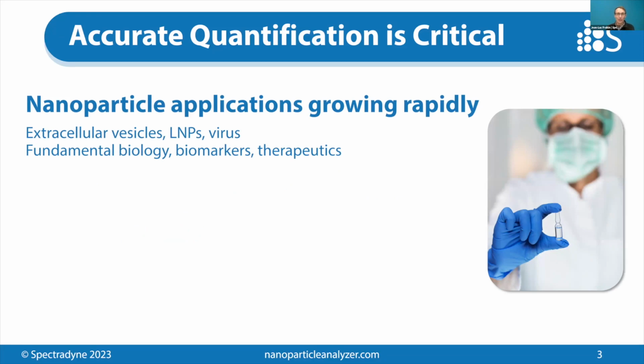The reason that's important is because nanoparticle applications are growing really rapidly. You may work with EVs or extracellular vesicles, LNPs or viruses, or any other kind of nanomedicine, nanoparticles. And these are used or studied in diverse applications: fundamental biology, so we understand what they're doing, investigation of nanoparticles as potential biomarkers, and in nanomedicine as therapeutics.